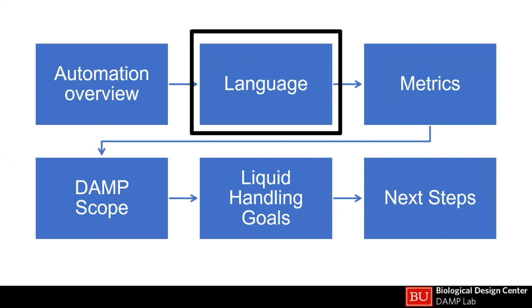So language, one thing I was thinking about as people were speaking. For example, with the pilot projects, I think lab automation in part is kind of a problem in translation. Daniel Segre and his microbiome initiative have protocols, and they talk to Kristen, and there has to be a translation there so that she understands what they're saying and what the protocol says.